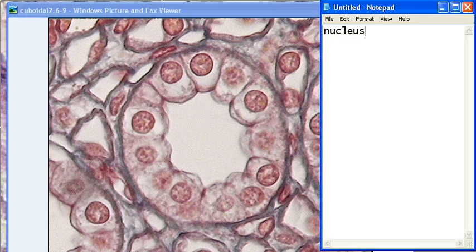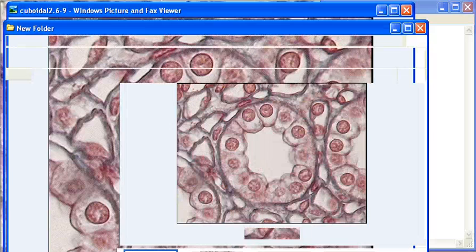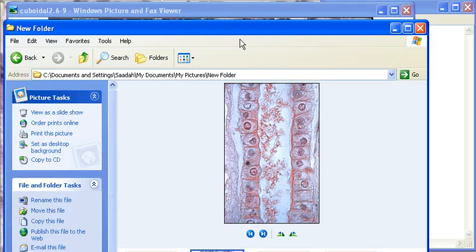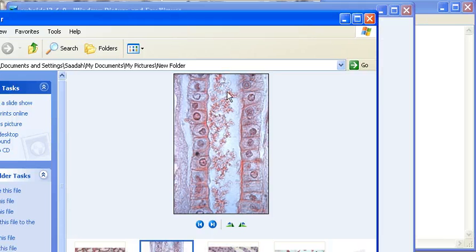Same thing for this one — this is cuboidal 2 and simple cuboidal epithelium. As you can see, the nucleuses are still in the same exact spot, same function, same structure. So don't get confused by these.